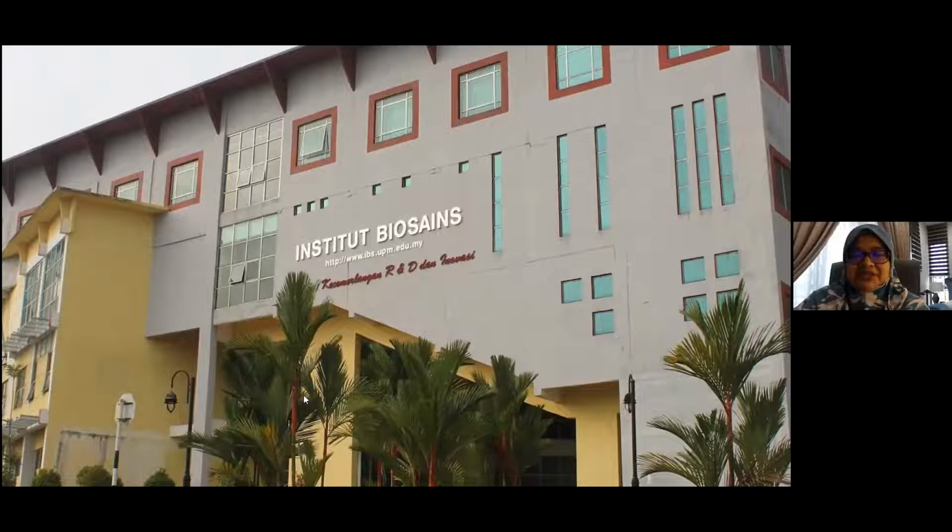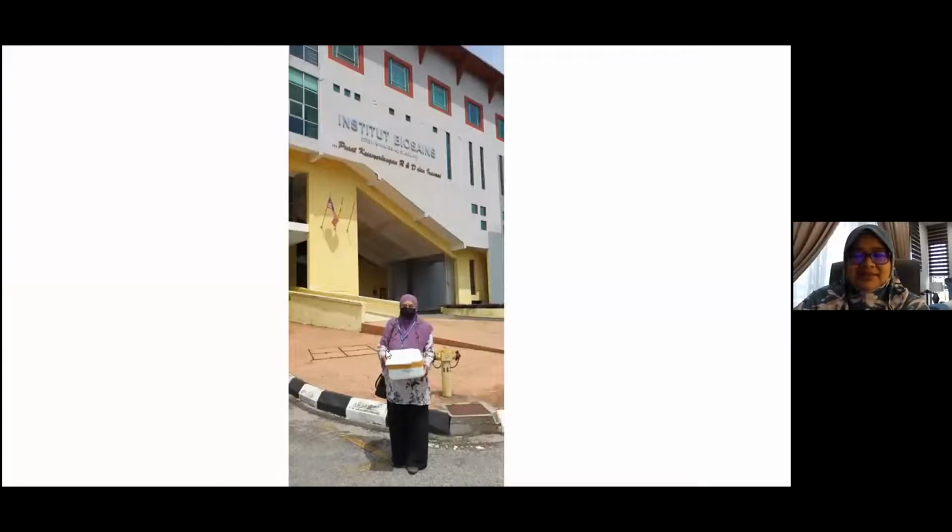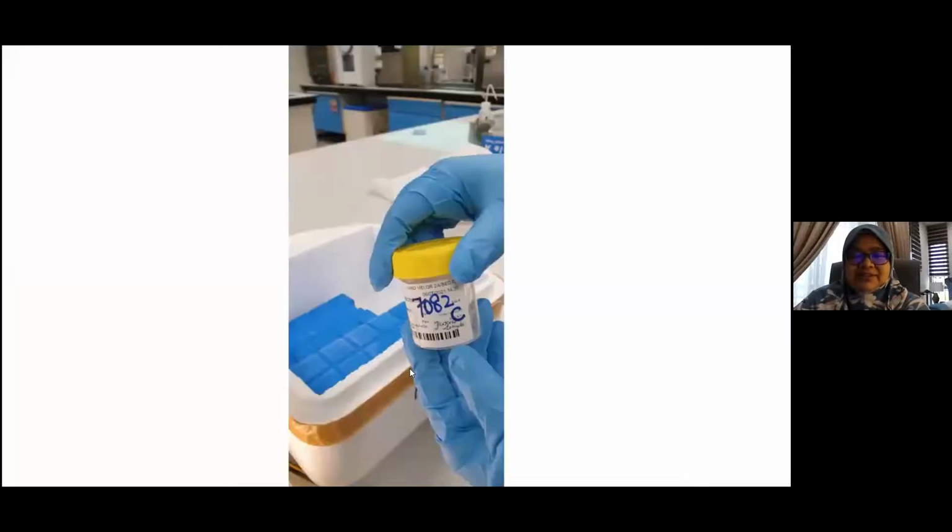It is in the main campus of UPM. This is my model, Dr. Irene, who is doing a renal attachment with me now. We keep the tissue in a box with ice to maintain it at 4 degrees Celsius.